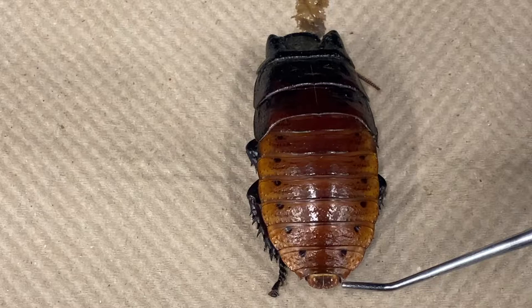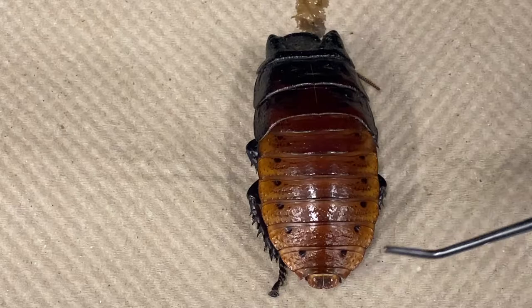You should be able to see the sensory cerci located near the last abdominal segment. The cerci are sensory organs that detect air movement, such as from a predator running up from behind, allowing the cockroach to evade capture.